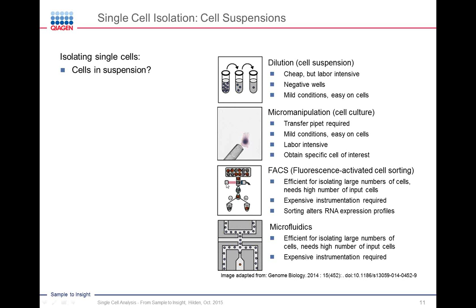The most common method for isolating single cells of a cell suspension is definitely FACS. So you have cells there, if they're not naturally fluorescent, you need to label them with something. Usually this is an antibody to something that you're interested in or this specific cell population is interested in, and it's fluorescent. And then you pass them across a laser with a detector, and where you see fluorescence, you sort these into one bin. Where you see no fluorescence, you throw them out.